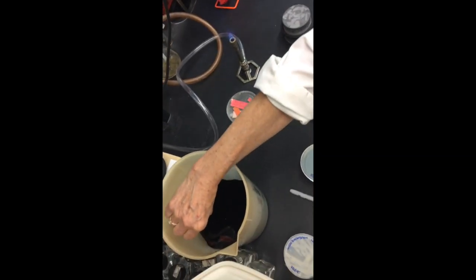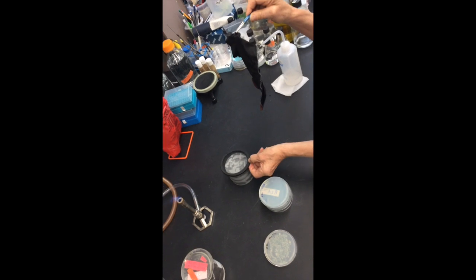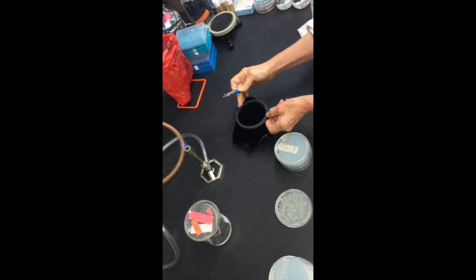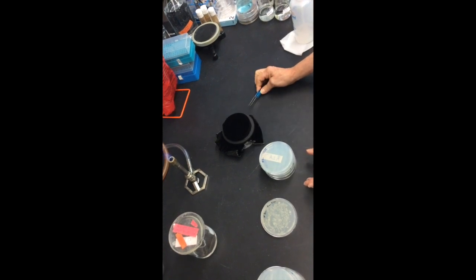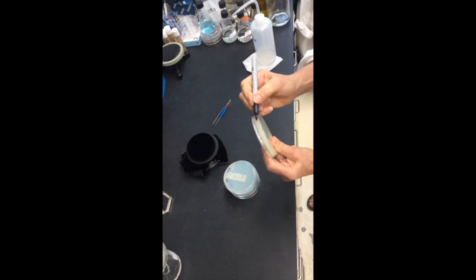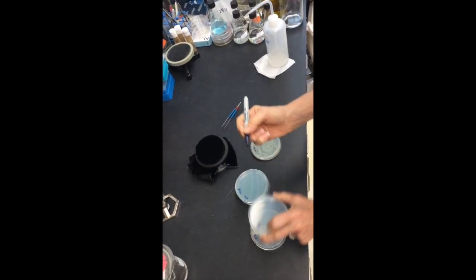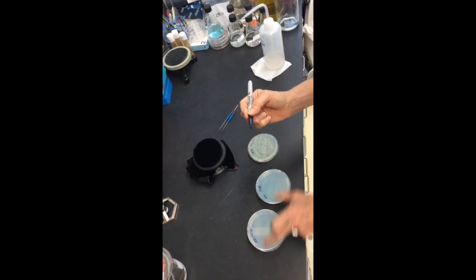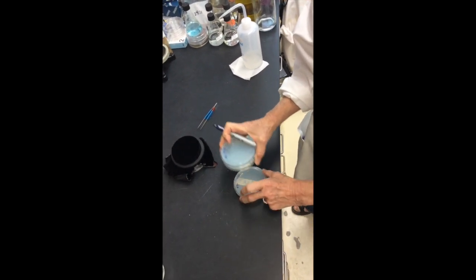Then we're going to take a sterile piece of velvet, simply velvet that you buy at a store. I've already ethanol cleaned this rack here, and I've cleaned this, and we're going to very gently put this over the velvet to make it tight, and I'm trying not to get my fingers on the edge. Now we're going to take this plate, I'm going to label the top of it, I'm going to mark it, and I'm going to mark all of these plates also so that I line them up at the same position. I'm going to try to do them in that order also, because that is my 0.5 plate.